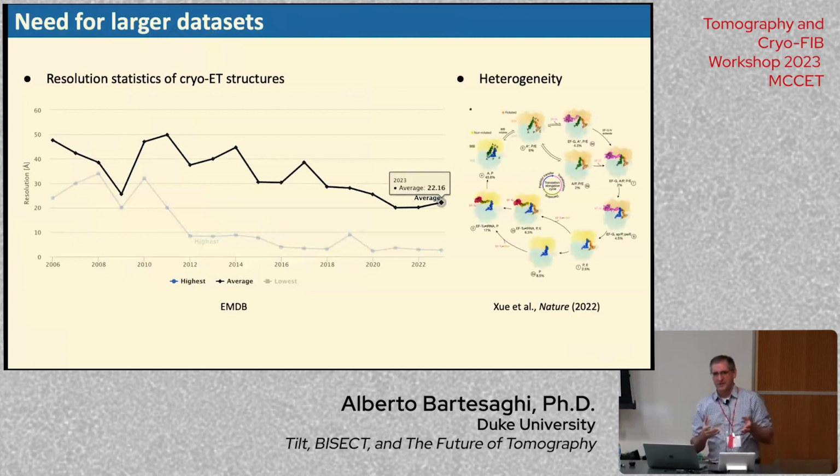Now, if you don't have enough data, then you're off to a bad start, right? Your chances of getting to high resolution are actually quite small.